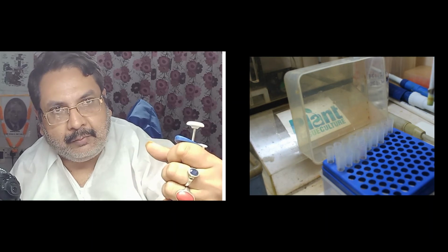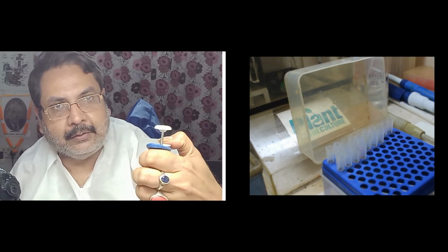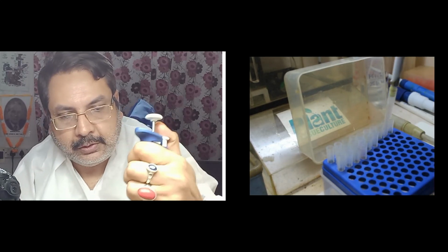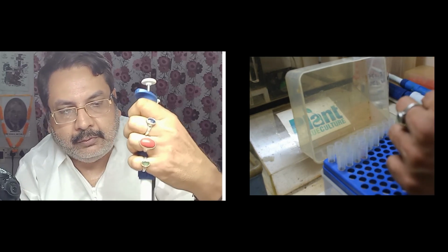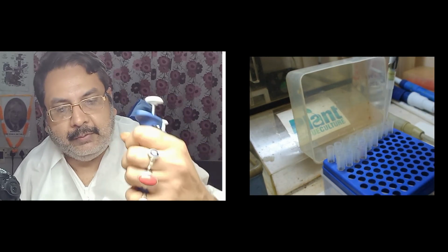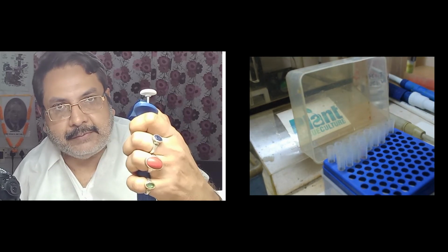Your forefinger will be here, your middle finger here, your ring finger here, and your little finger here, and your thumb will go on the plunger and also on this release button. First you have to place the auto pipette on the tip firmly. Don't make it loose, not like this, it will fall off. So you have to press the auto pipette firmly and take it out. Now to release, just release this button.